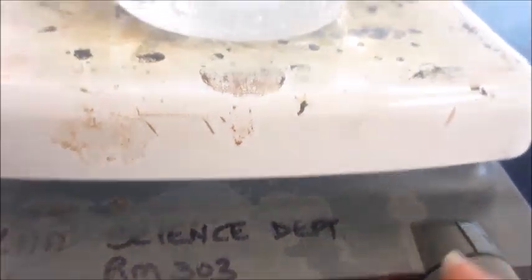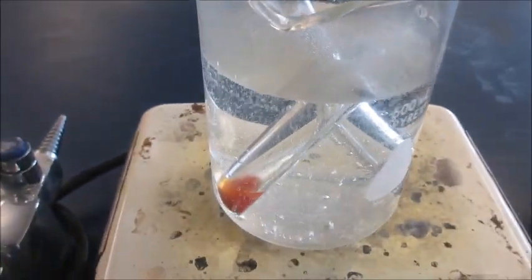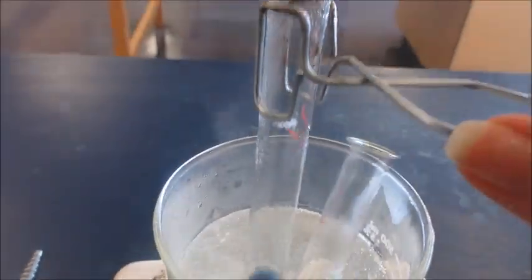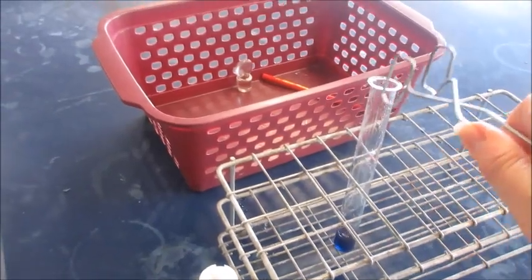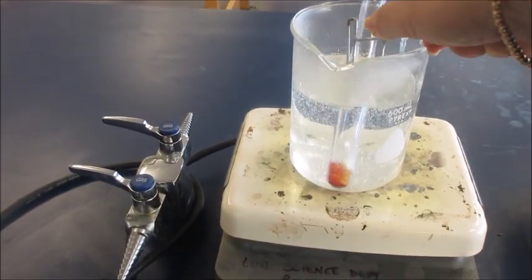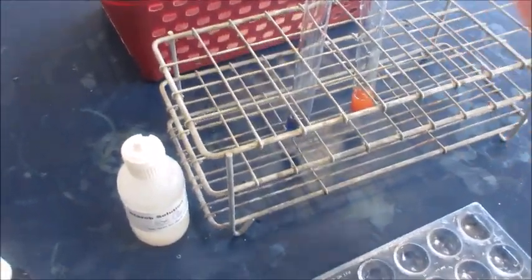When you are finished, make sure you turn off the heat and carefully remove the test tubes from the hot water using the test tube tongs. Here's a close-up.